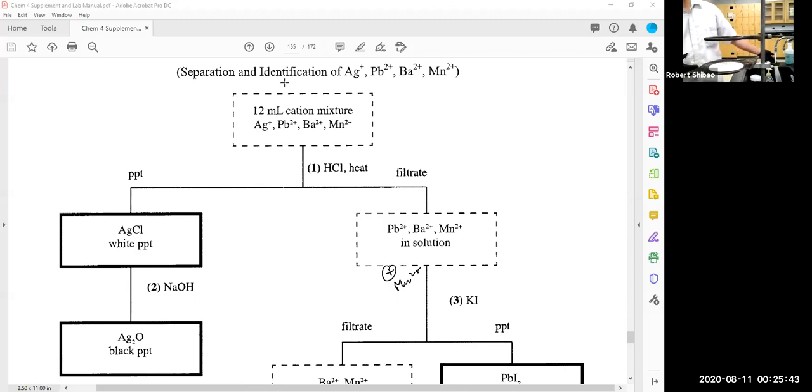Now, you know boiling water takes time, so this is something you should pre-plan. What I did was something called poor planning. If I had read through this experiment completely, I would have known that I needed a hot water bath. And I would have set that up first thing before I started any work, before I went to the stock room, before I did anything. I would have set up my hot water bath, which consists of about a half full beaker here, and then we're going to put the test tube in there to heat it up.